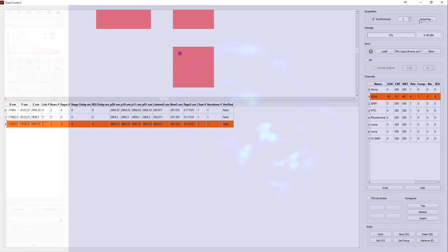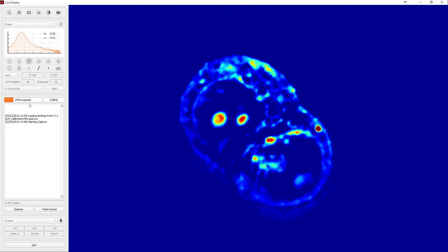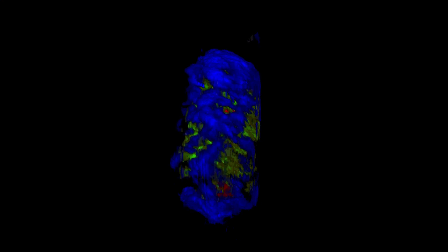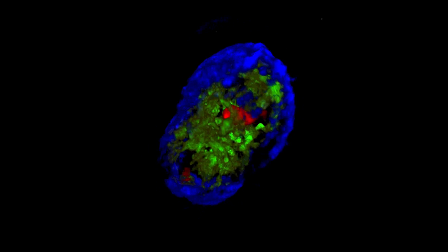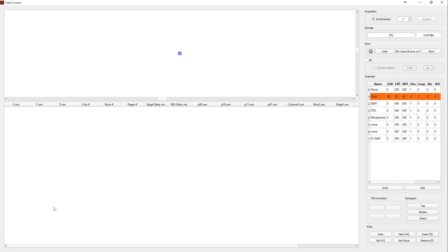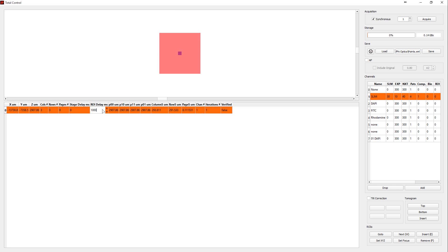Or maybe you are interested in doing a Z-stack — no problem. You set the Z-step and the scanning range, and you are done. What if you are designing a complex experiment that combines several channels of fluorescence, multiple mosaics, Z-stacks, and all Z-steps at multiple time points?